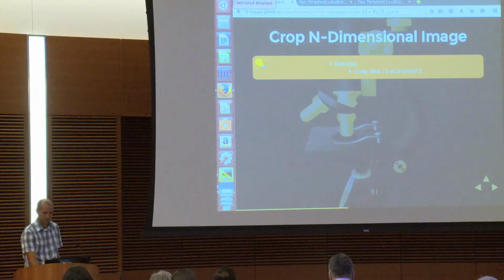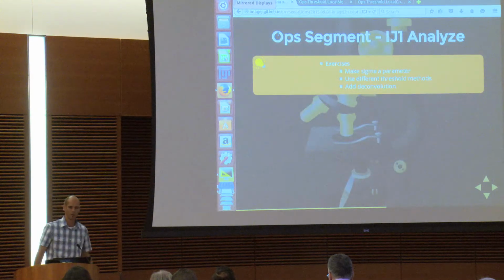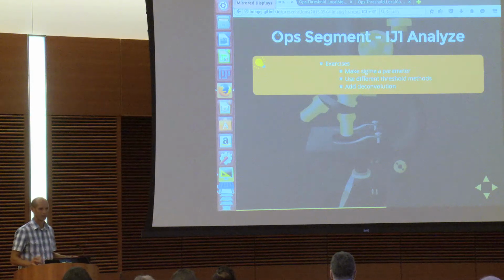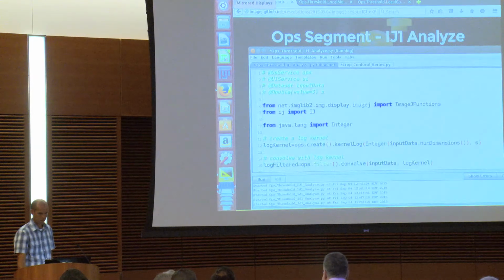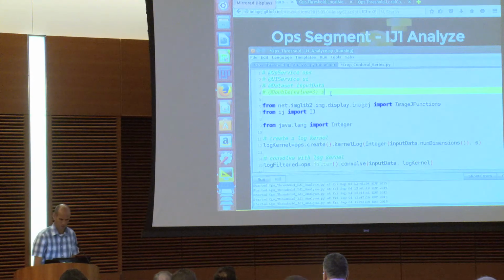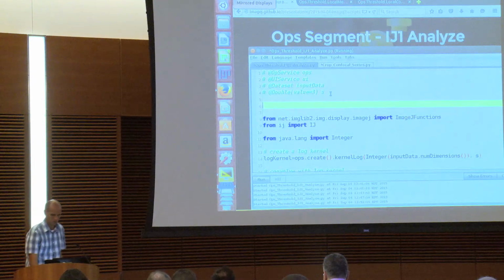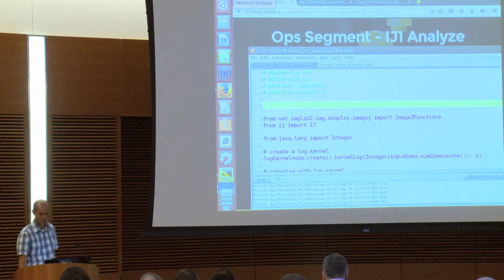Okay, thanks. So the final exercise here is add deconvolution as a second pre-processing step. First thing I'm going to do, and here's a little trick that I use sometimes, is if you put 3 quotes, it comments out everything.